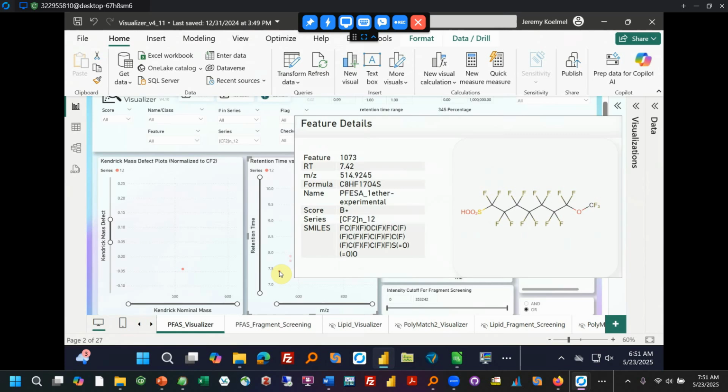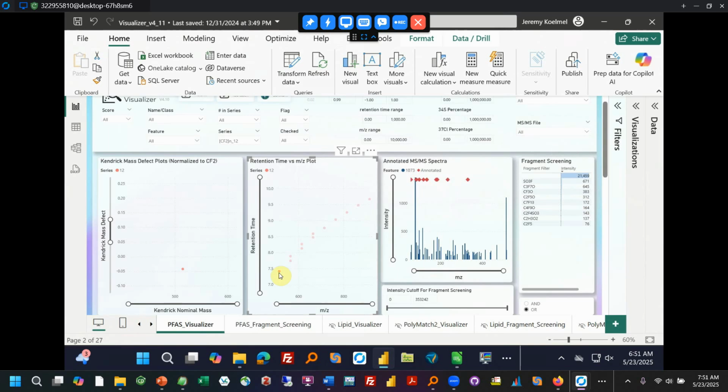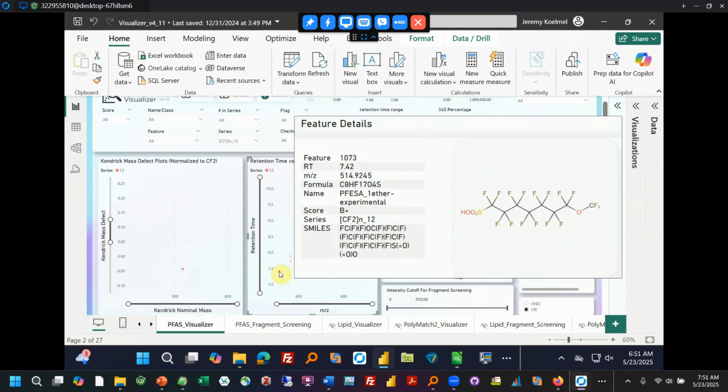So actually, when we see the species, even though it's saying OCF3, that oxygen should actually be in the main isomer. Not one position over, which would be OC2F5, and two positions over would be OC3F7. So the oxygen should be two positions over to the left.